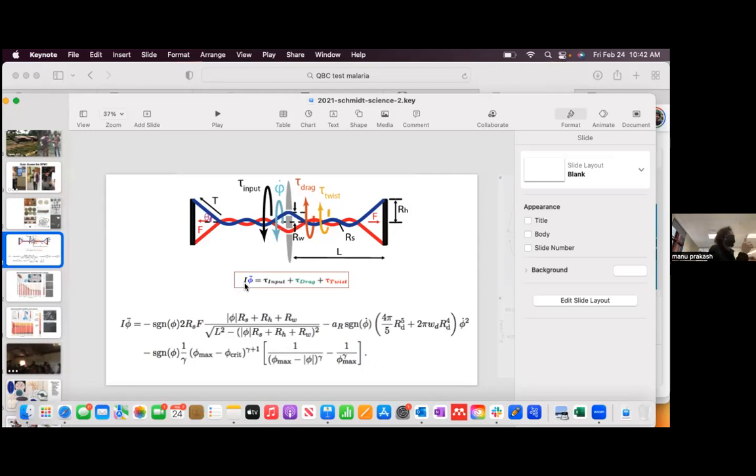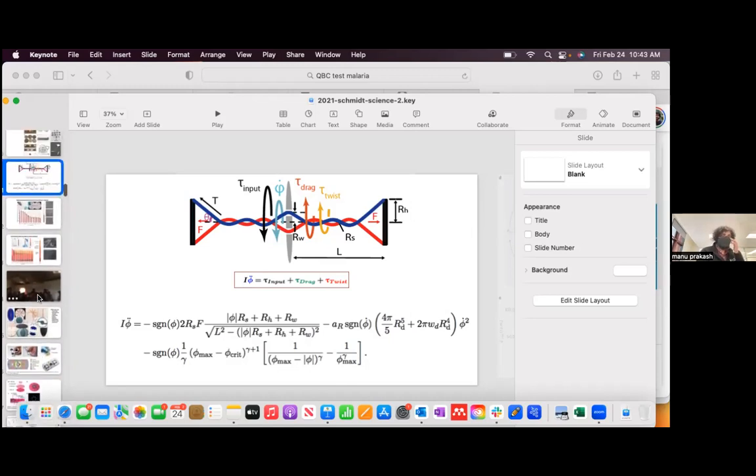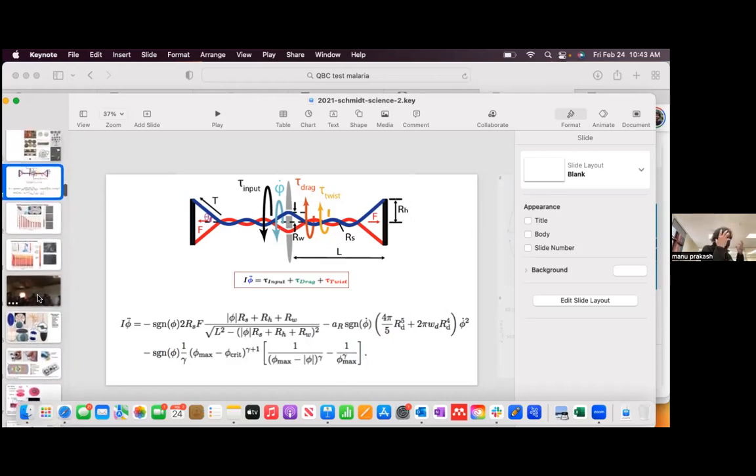But the idea is to implement a notion like that in what we call the paperfuge, which has no mechanical parts. So maybe it might have been confusing. There are actually two designs here that are solving the same problem, but they're not the same object. This object is very different from the second object that we're making. Does that make sense? Yeah. And I'll show you guys a couple of videos, but then we'll just come and build and it'll internalize quite a lot.